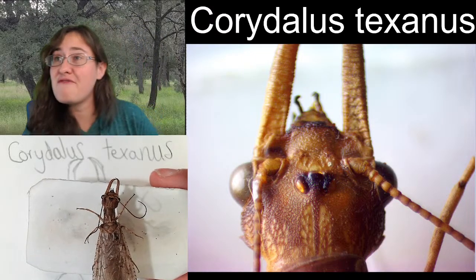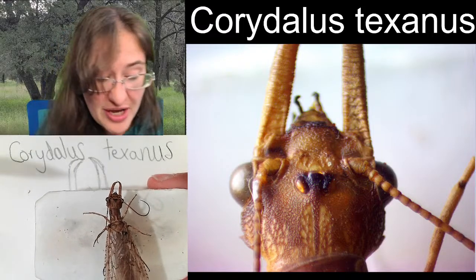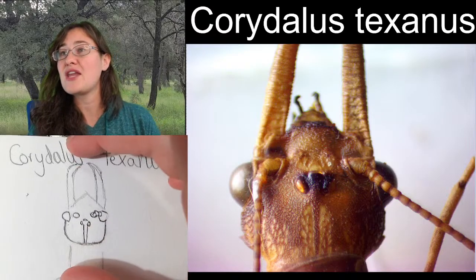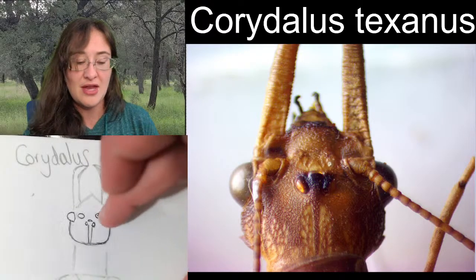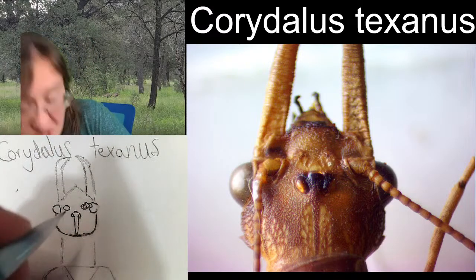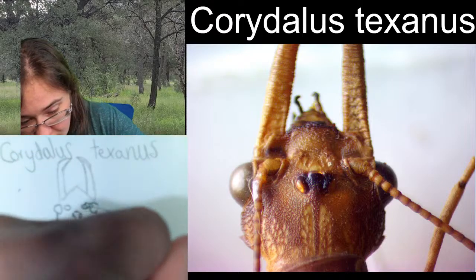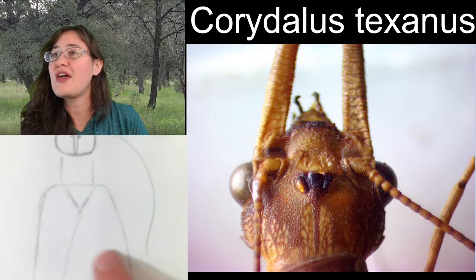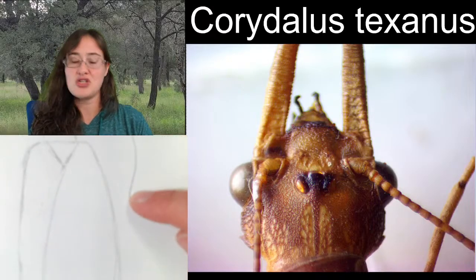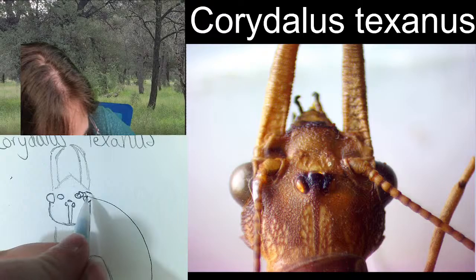The length of the entire mandible's head and pronotum combined is what it looks like to me. If I was to take those antennae and stretch them out, so what you could do is put your fingers over that piece and then try and figure out how long your antennae are going to be. For me, it's going to look something like this, likely. Coming out from the head, going past the shoulders, about a third of the way down the wings. I think that's about right for me.